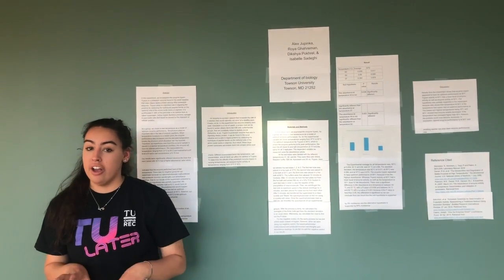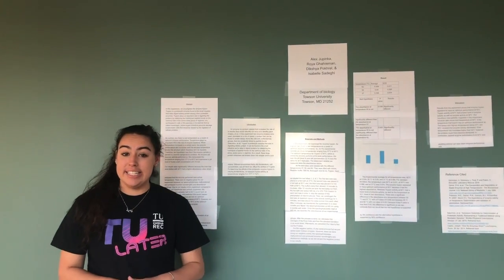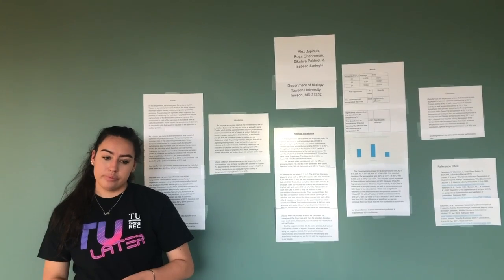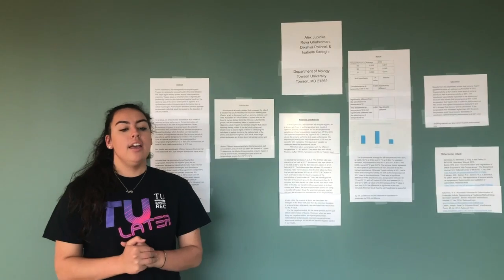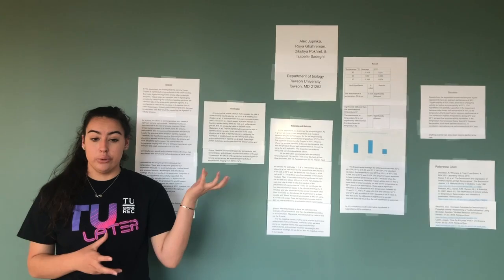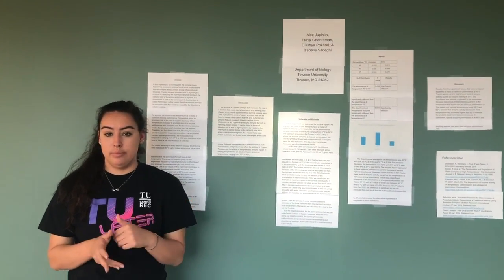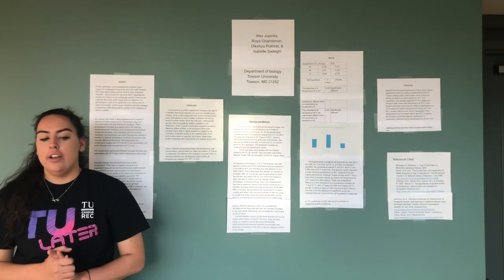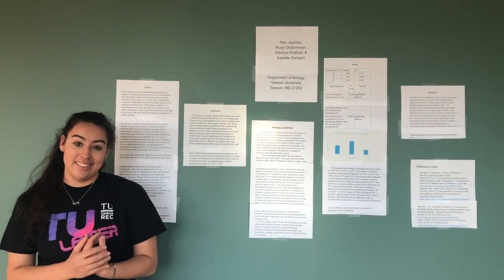So a really important part of our experiment was adding TCA. We added the TCA to stop the reaction and the precipitation of macromolecules. It was also very important to centrifuge the TCA, because we had to separate the larger particles from the solution, and the pellet consisted of the enzyme and the substrate. The substrate we used was azocasein, and sulfanilamide correlates to the ability of trypsin and the effects it has.